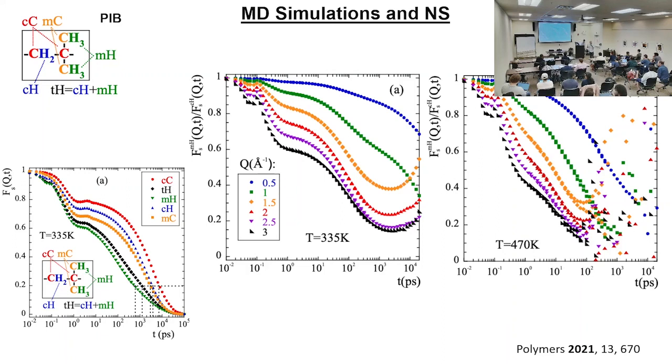Most of the time, we will have an idea like, okay, if it's this fast, then maybe this wavelength will work. So you go there, measure the data for 5-6 hours, fit it, and if you realize that you are still not seeing it, then you change the neutron wavelength and tune the instrument resolution. So there has to be fine tuning. Run the experiment for 2 hours, choose your best temperature, and see if you can see it nicely. If not, then you adjust your wavelength.